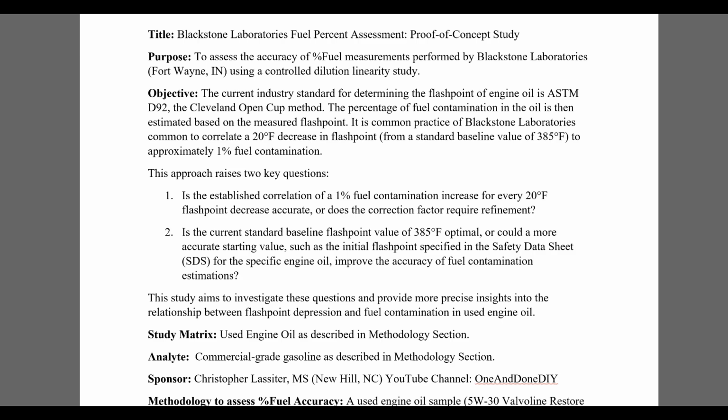Again, I got to backtrack a little bit to the FTIR, is that when you get this data, you have to take it into context. So let's just say if you check the flashpoint and it decreased, say, 100 degrees, but the viscosity did not change at all, that'll be different than if the viscosity also decreased as well. And we'll talk about it a little bit more when we actually look at the data here.